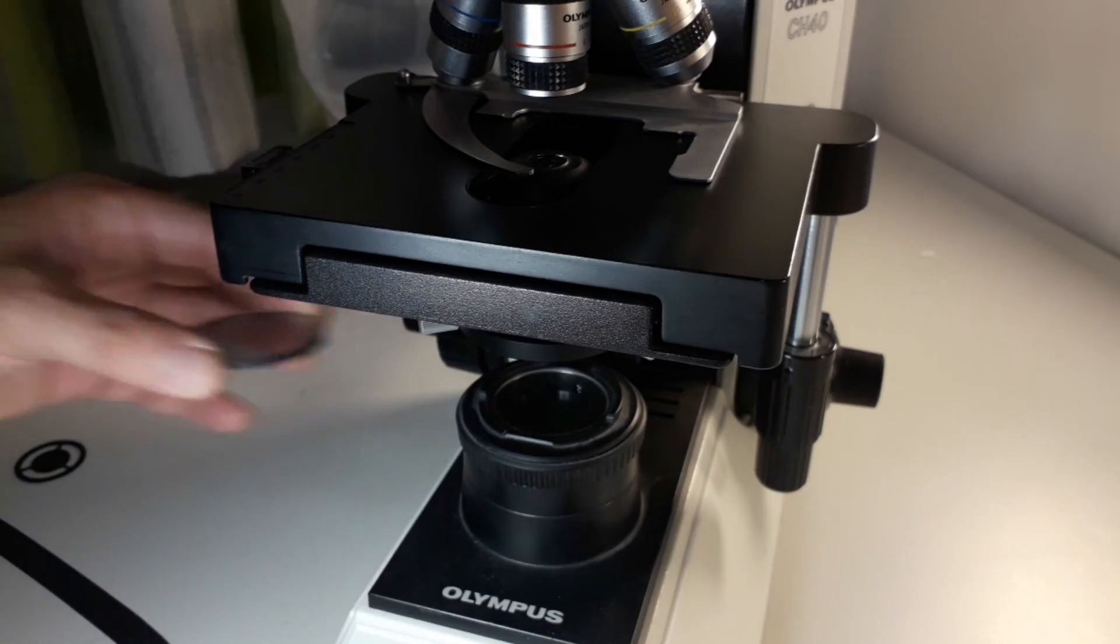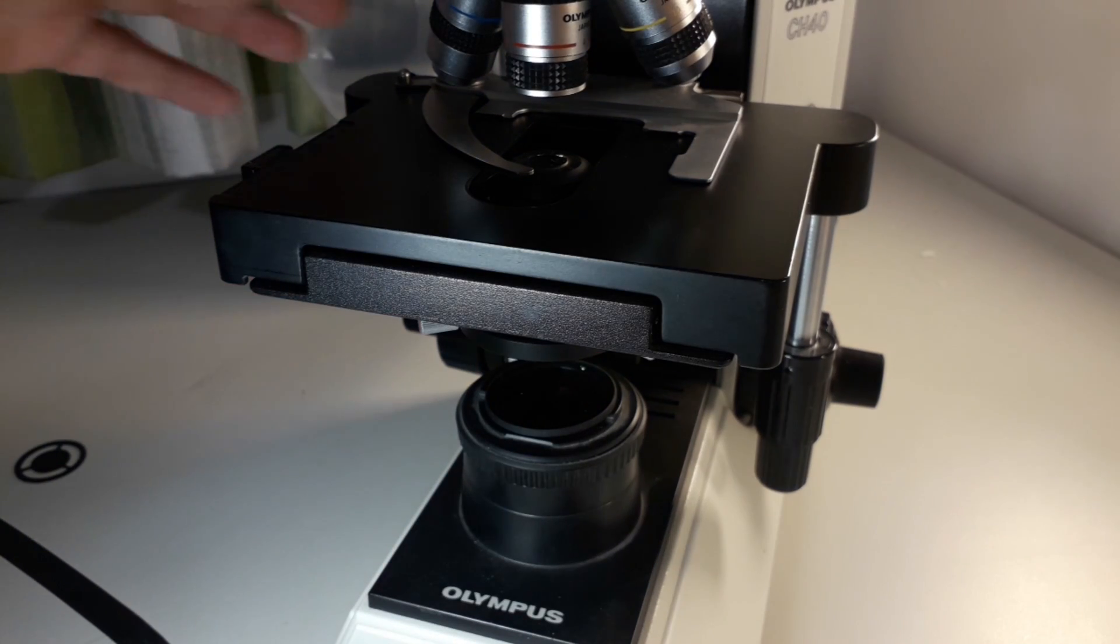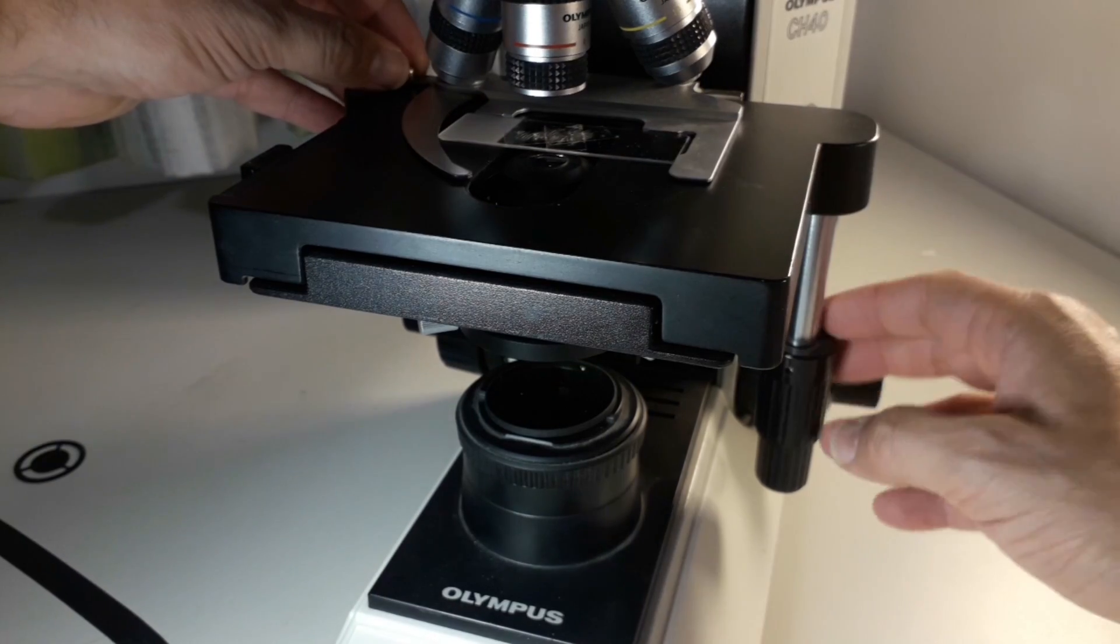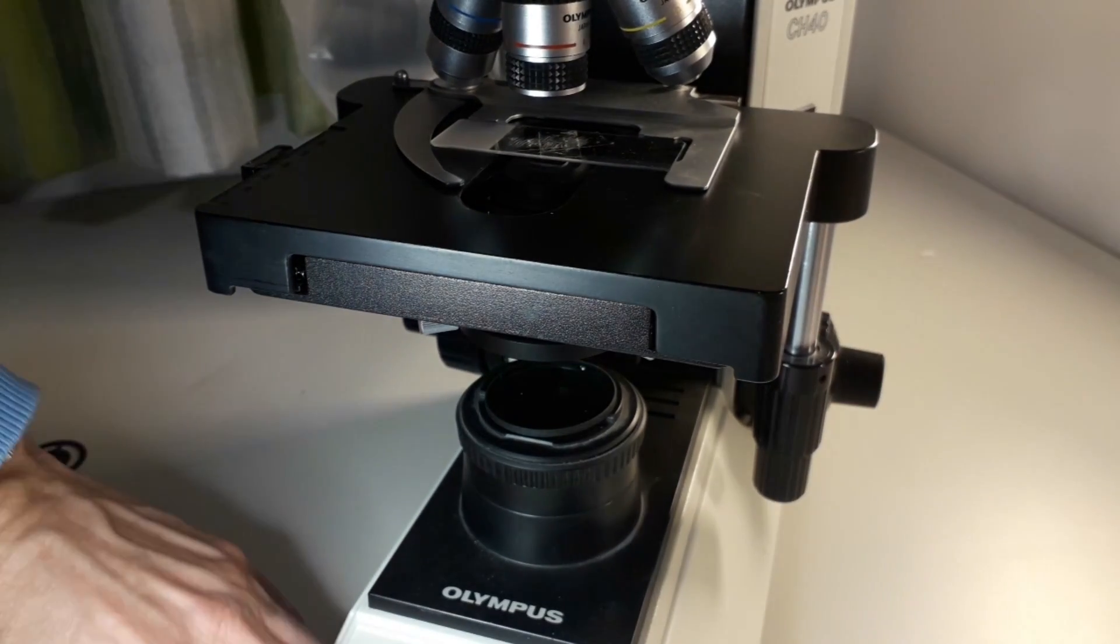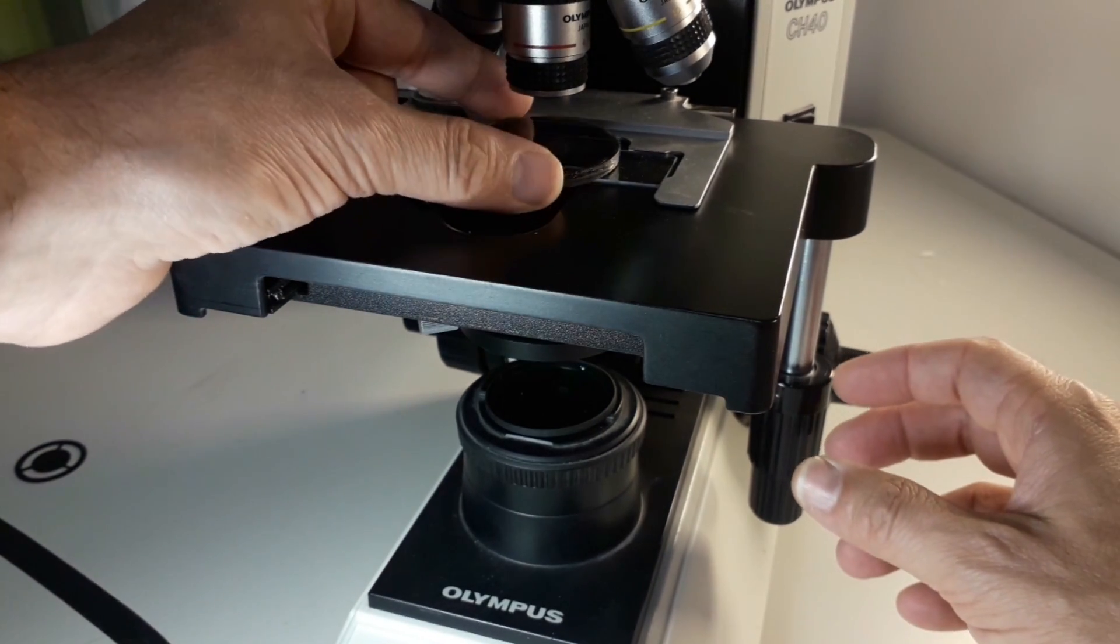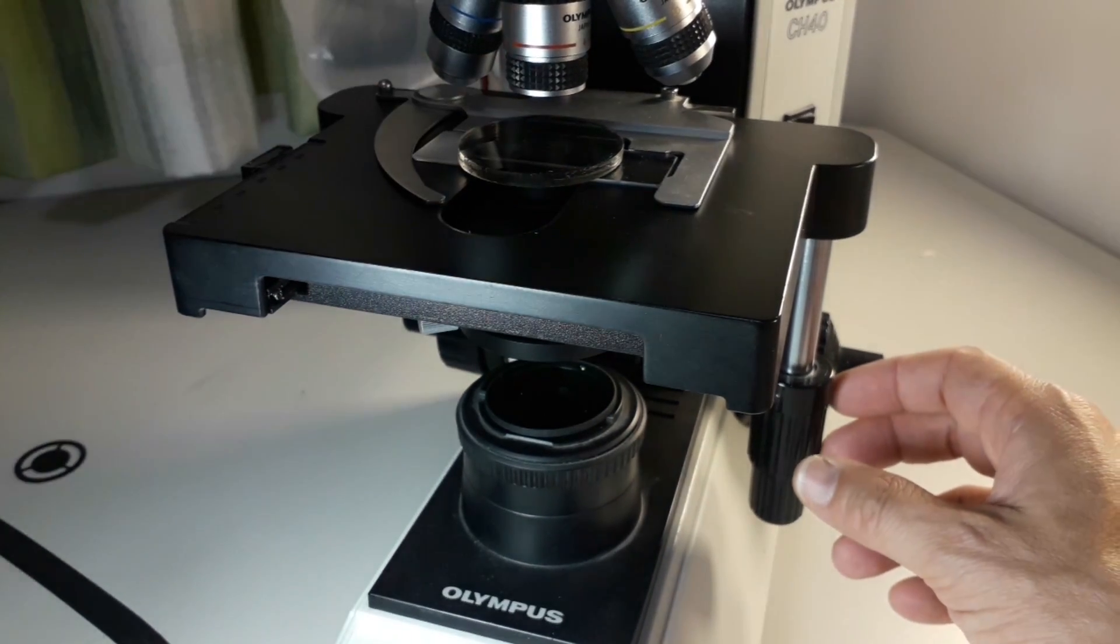I place the polarizing filter on my light source, then I place the slide on the microscope stage, and on top of it goes the second filter. And basically by turning the bottom filter I can get all sorts of interesting light effects.